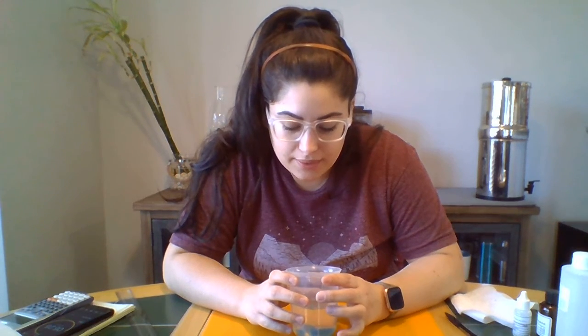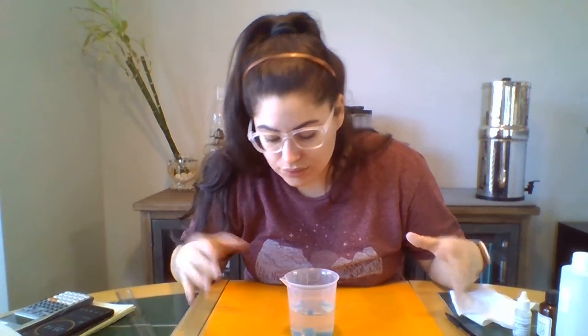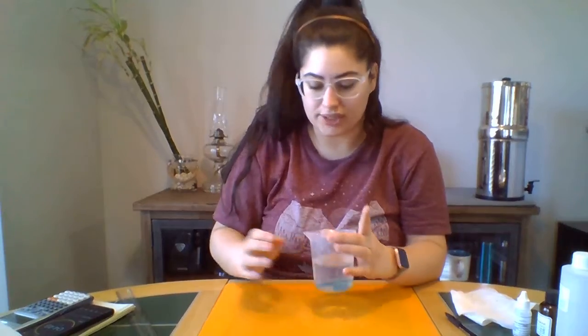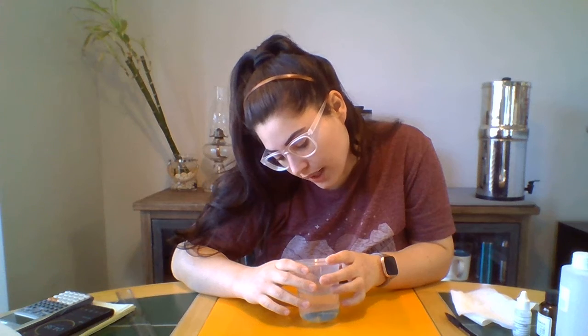On the rectangular one, the 1 centimeter by 1 centimeter by 6 centimeters, you can kind of see how on the long edges, because there's more area for the vinegar to get to, it's changing color. But on the short edges, I think they are touching the walls a little bit, so they're not changing as fast. I'm guessing that's just because they're touching the walls and not a lot of liquid is able to get between there. Oh, well, maybe not. It's catching up.